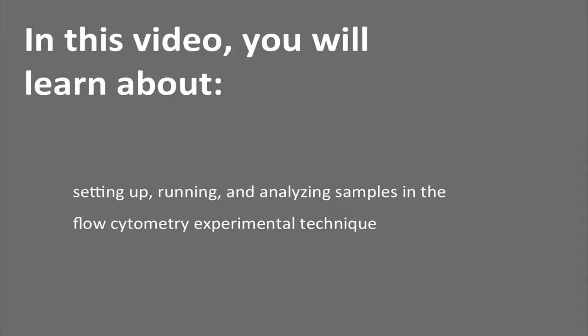We will show you how to set up, run, and analyze a flow cytometry experimental technique, starting with the select technique page in StarCellBio.